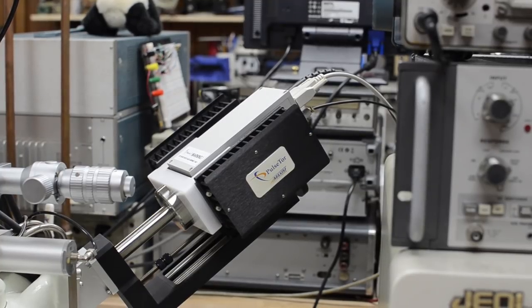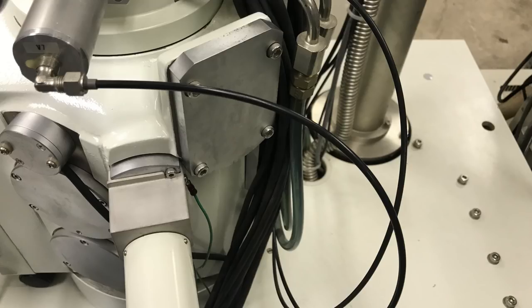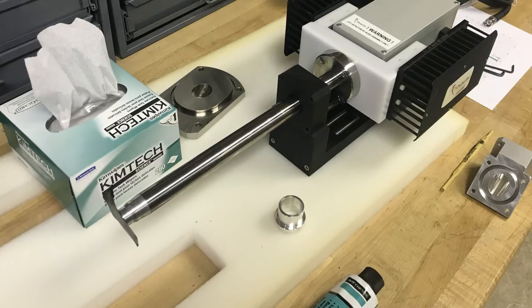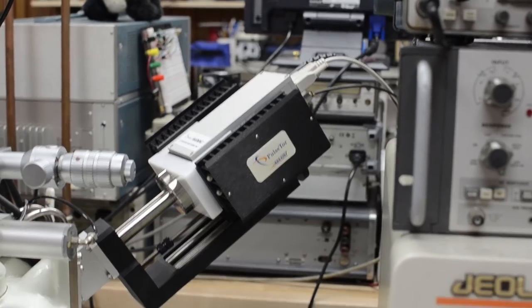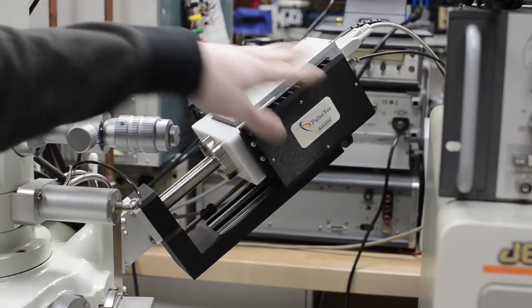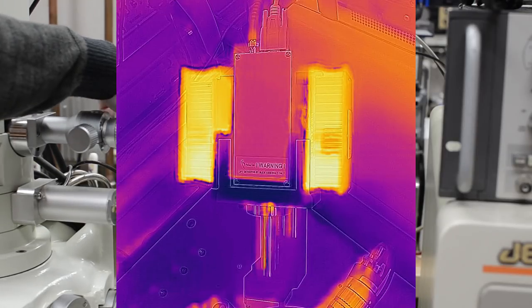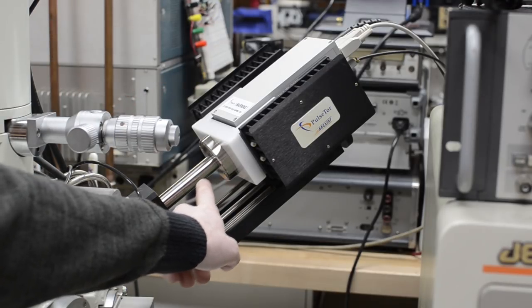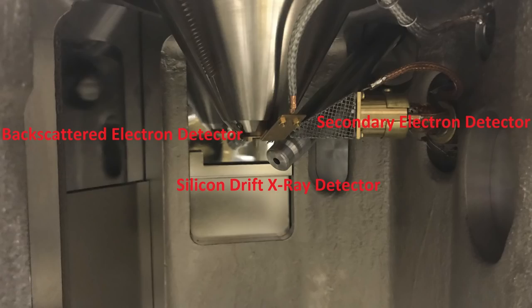Let's take a look at the hardware real quick. This is the SDD itself, the silicon drift detector, and it's mounted onto the side of my SEM. They actually have a port here specifically for EDS. It was very convenient. We had to make some custom mounting plates for it. At the sides of it, there's these two large heat sinks. They have Peltier modules on the inside. These get warm while the area in between them gets quite cold, cold to negative 30 C.